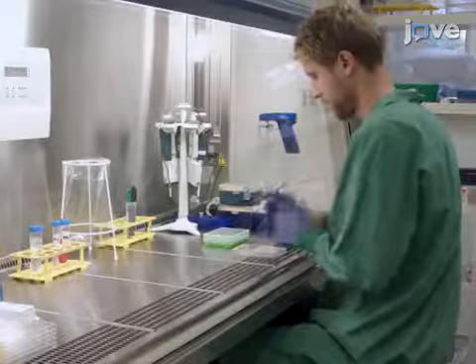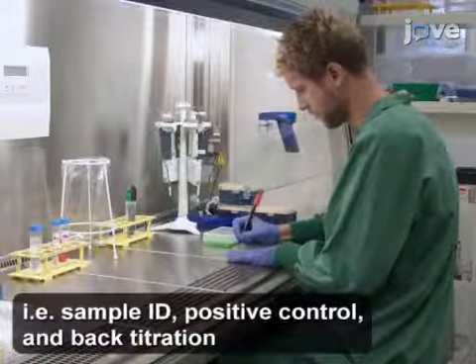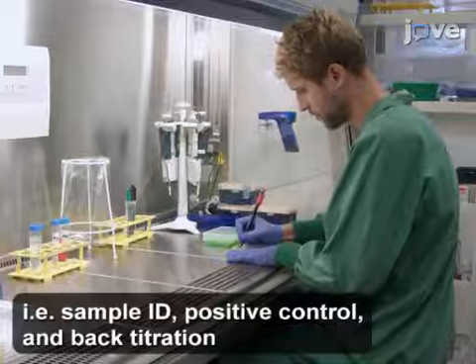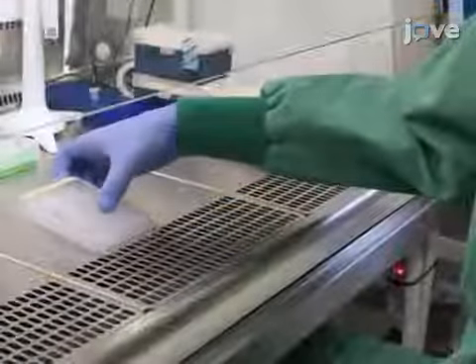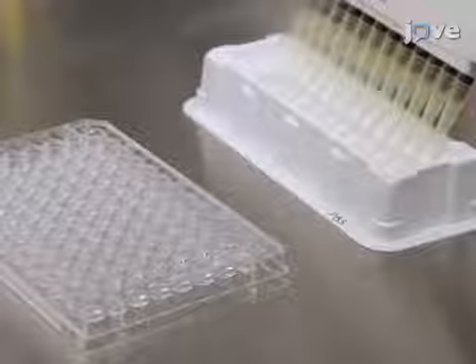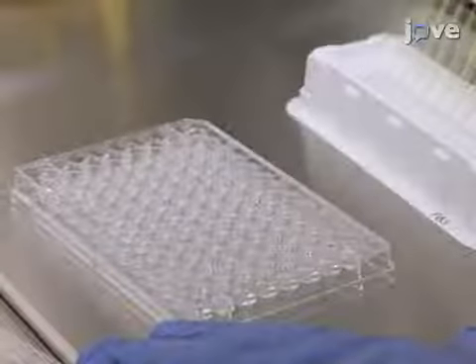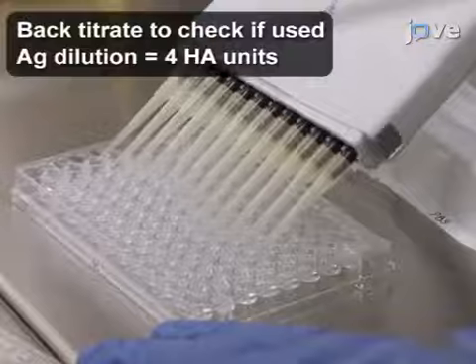Begin by labeling 96 well microtiter plates with the appropriate experimental information. Then turn the plate in the vertical orientation and use a multi-channel pipette to add 25 microliters of PBS to every well except the first well of the bottom back titration row.